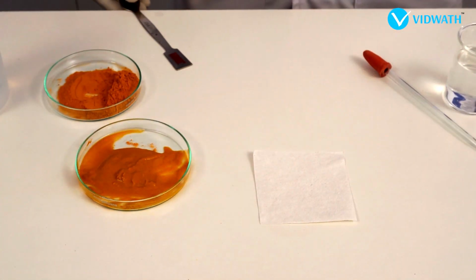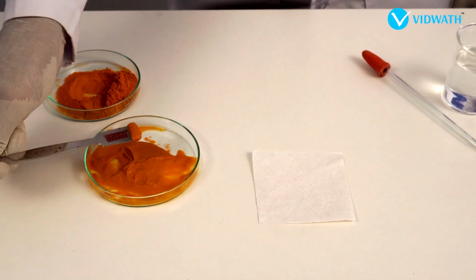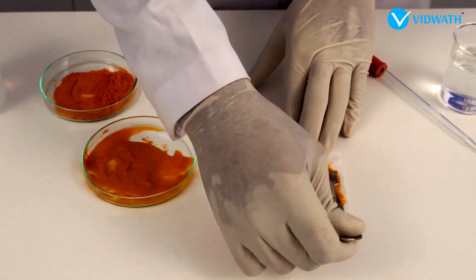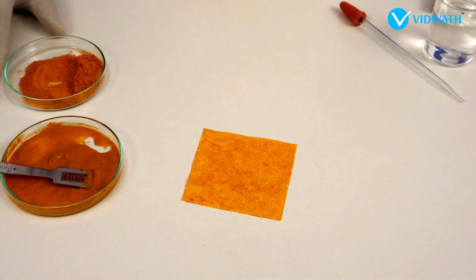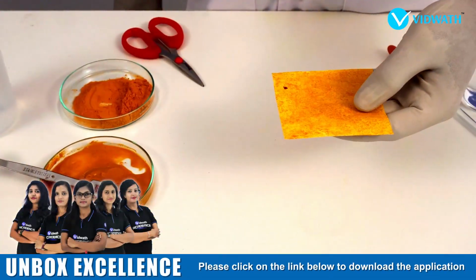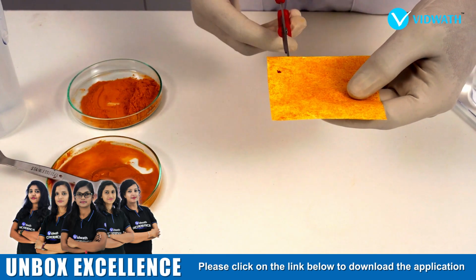Make turmeric paper by depositing turmeric paste on filter paper and drying it. Cut thin strips of the yellow paper obtained.